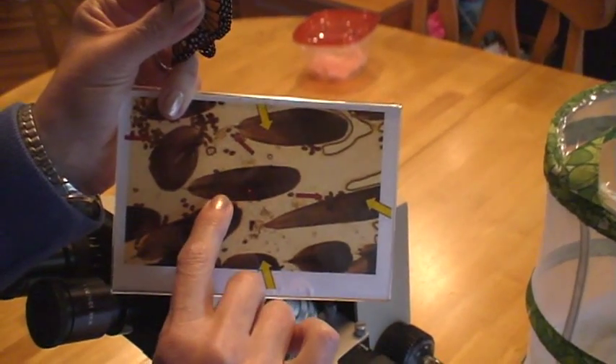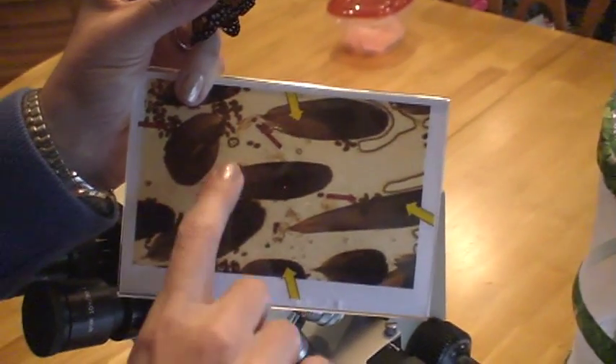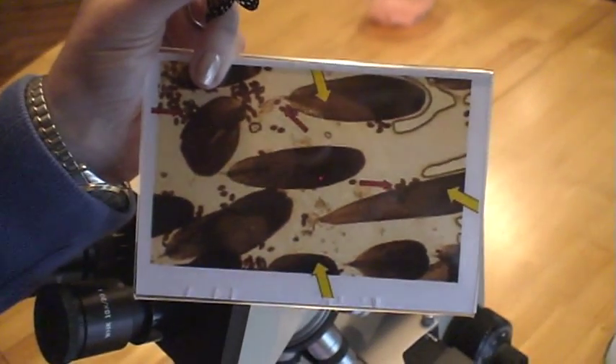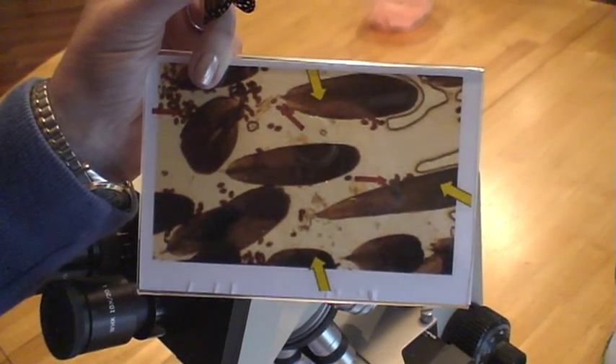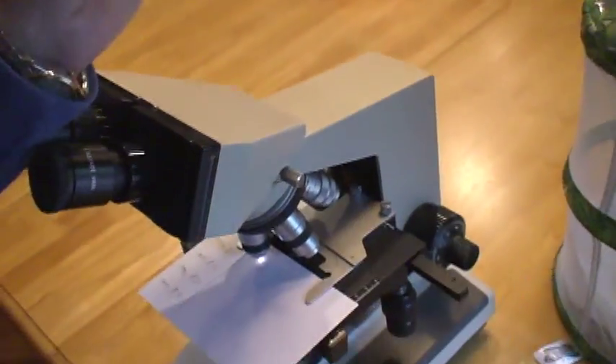These are the butterfly scales that they have along their entire body and wings. And then these are the parasites OE. This particular butterfly does not have any parasites, so I will release them.